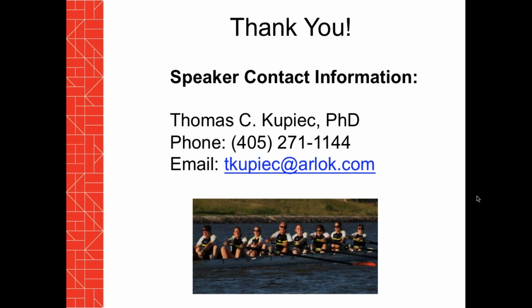You want to compound your non-steriles in as clean an environment as you can, so ISO 5 would be preferred. I would say that's a good chance for you to explore your results from your 61 testing, to establish the levels of process control that you have in place, and then determine whether what you've got set up is meeting the requirements.